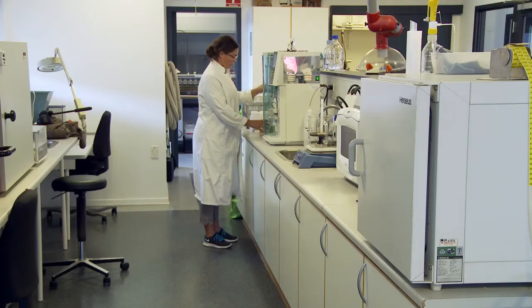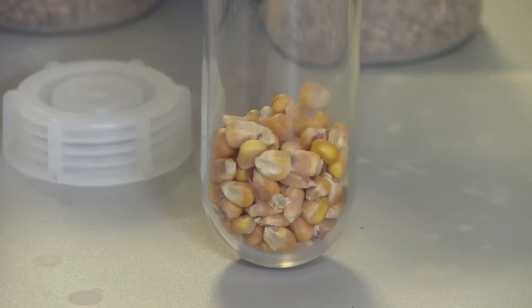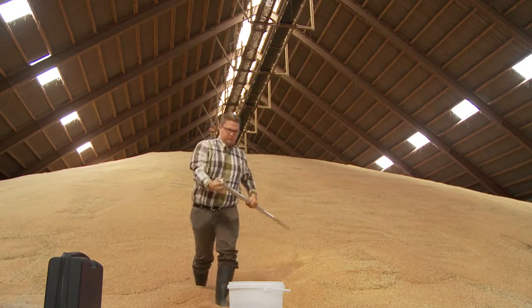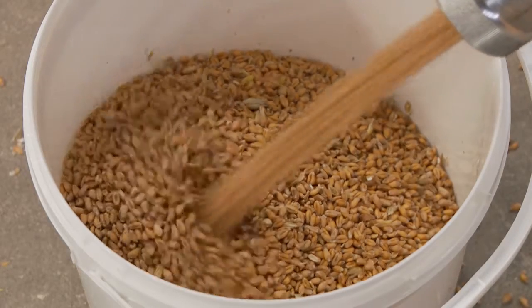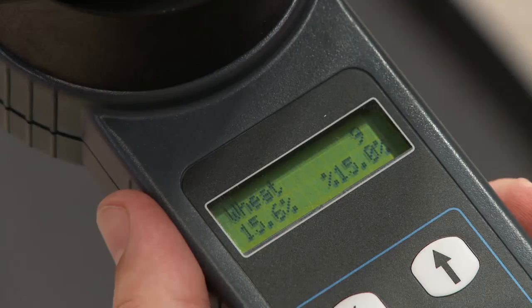This Danish high technology moisture analyzer gives you the market's safest measurement of water content in crops and seeds. Integrated automatic temperature compensation, grinding and compression of the sample gives a more reliable result every time.